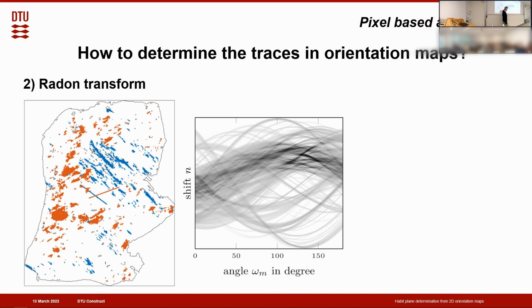What we can see is that we have one region here where we have a lot of high intensity and low intensity. And that is, again, if we have a line that's oriented in this angle and we go through our map here, we might hit a big chunk of material, no material, material, no material. Whereas perpendicular to this, we have quite a smeared region. So actually the periodicity of this microstructure is also reflected in this Radon transform.